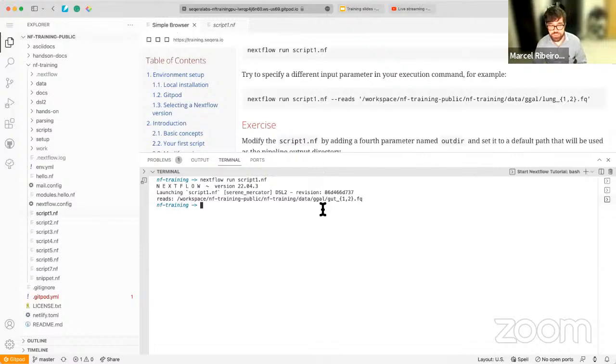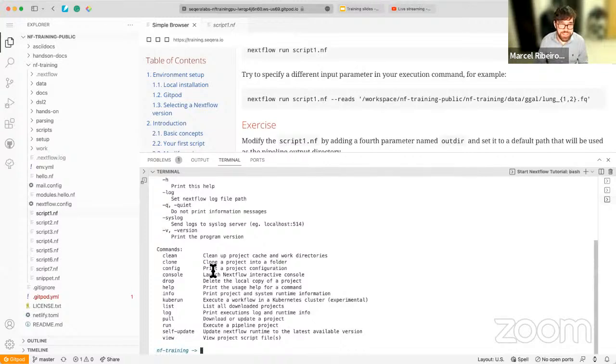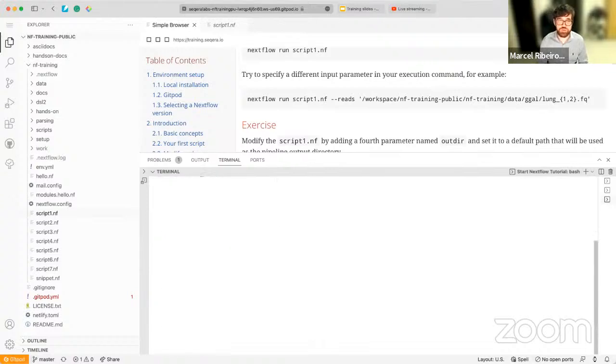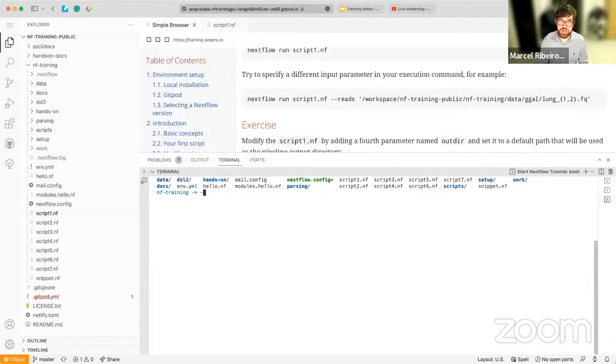And there's something very interesting to know. If you do nextflow -h, you're going to have the help from Nextflow. And all the parameters you're going to see have one single dash, as you can see here. So whenever you were wondering if you should use one dash or two, the single-dash ones are options and parameters for Nextflow itself, the Nextflow engine, okay?